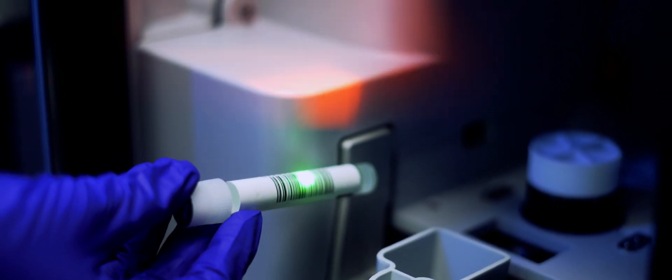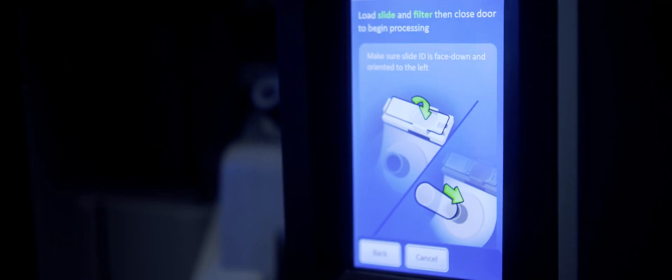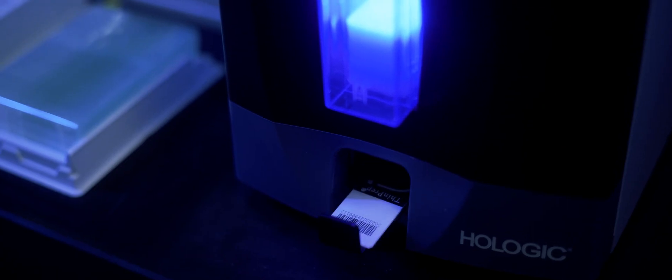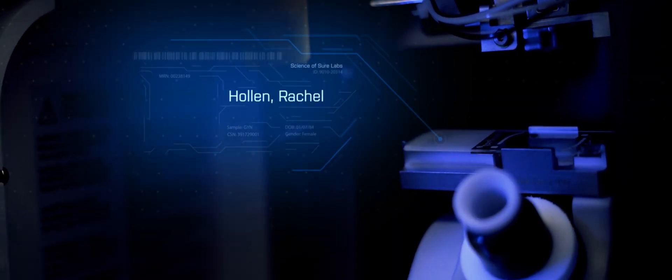An intuitive touch screen interface tracks sample progress and allows you to effortlessly prepare both a molecular aliquot and cytology slide, offering the same GYN, non-GYN, and EuroCite cytology processing as other ThinPrep processors.